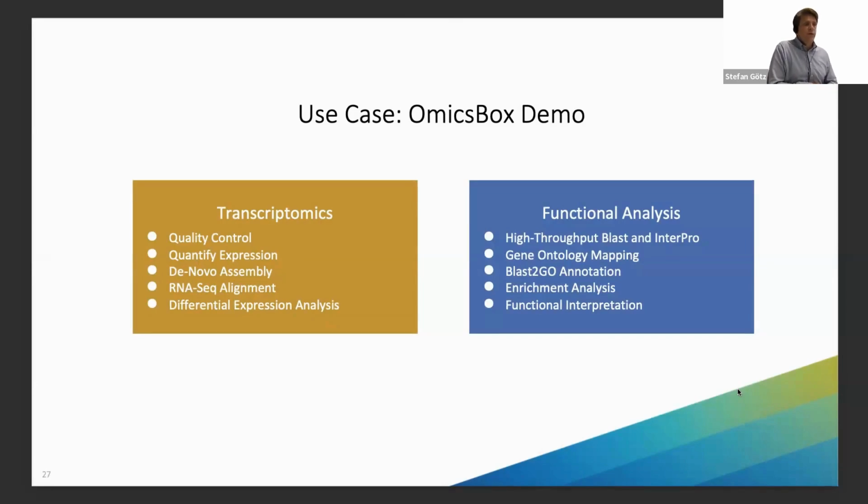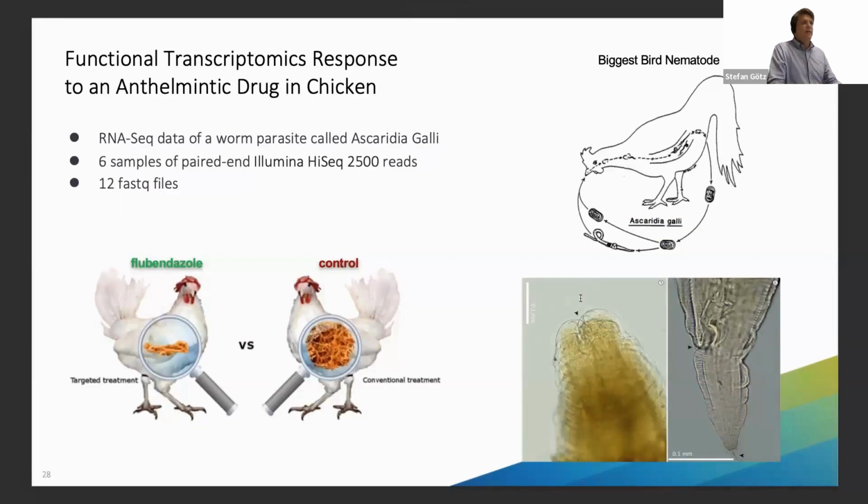So we will be using basically only two modules today: the transcriptomics module for our raw data analysis, and then the functional analysis, where we will do the annotation and the functional interpretation.